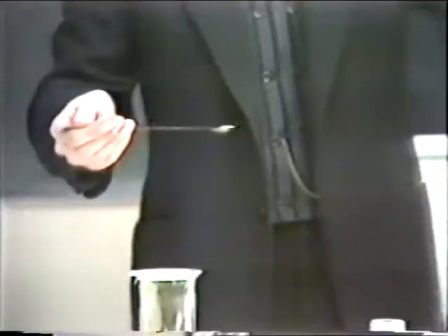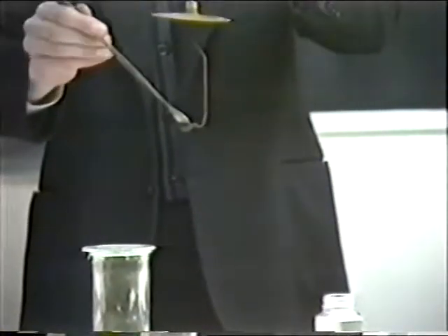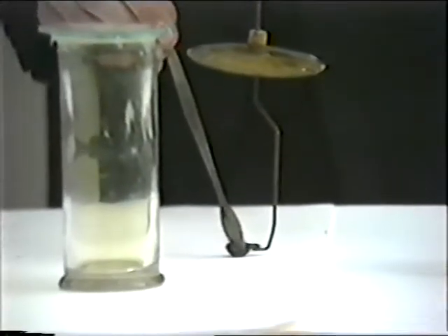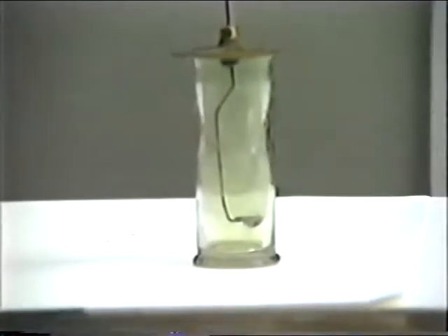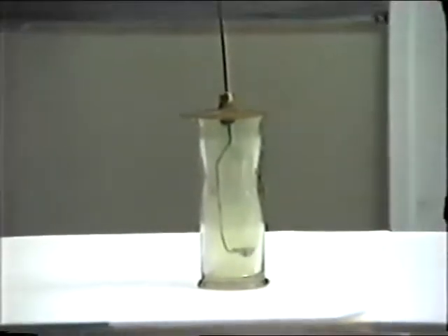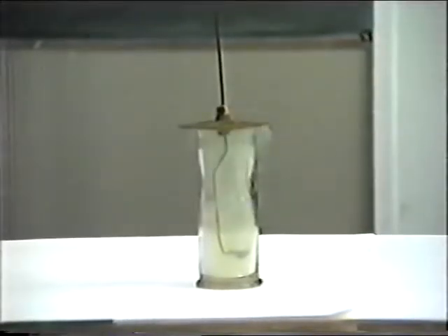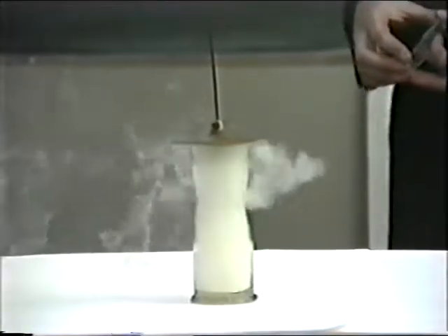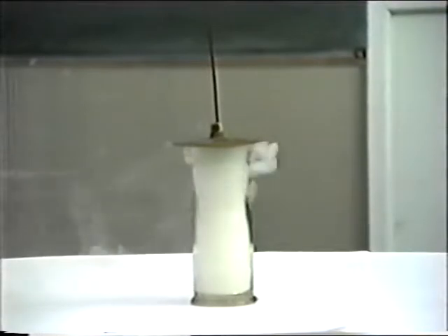Now we shall pour a few small pieces of white phosphorus onto our deflagrating spoon. As I have said, this is an extremely dangerous element because of the extreme inflammability of phosphorus. You can possibly observe it beginning to fume already. Now, when I lower it into the gas jar of chlorine, you will observe that within the space of a few seconds, a vigorous reaction will take place and white fumes will be produced. There it is, it's beginning to sparkle already. And there we go, dense white fumes are being produced of the gas phosphorus trichloride. It's burning with a yellow flame.